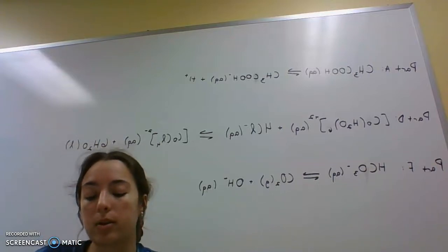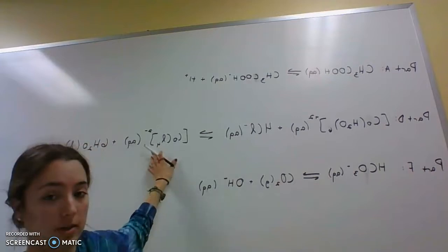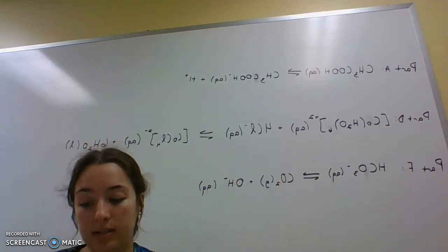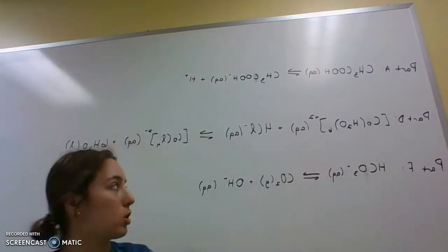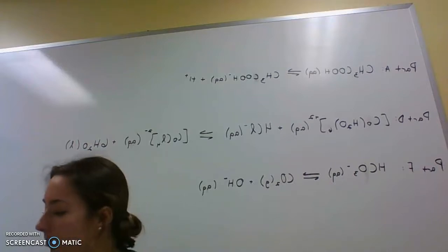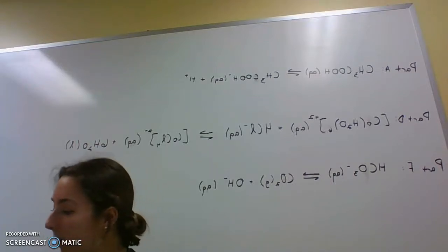It's endothermic because when there's an increase of heat, it shifts the reaction to the right, which we saw because it turned more blue. And when heat is removed, it shifted back to the left, which was the pink side, which we also saw in our observation based off of Le Chatelier's principle, and our chemical equation. So that is how we know this reaction is endothermic.